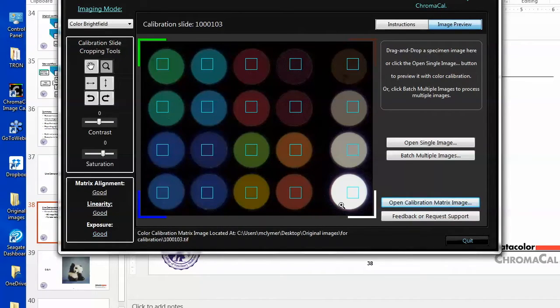And then also exposure. We'll make sure that this slide in particular is not overexposed. The whole background is black, so if you use auto exposure, the tendency is to swamp it. So when you're first acquiring this image, you just want to make sure that you take a look at this white patch and it's not 255, it's not saturated. I always shoot for 220 to 240.